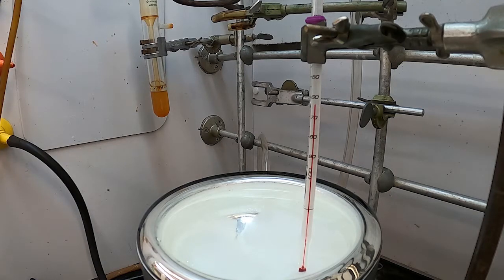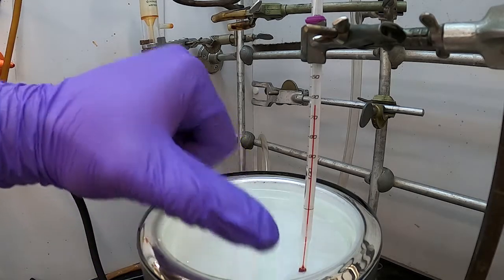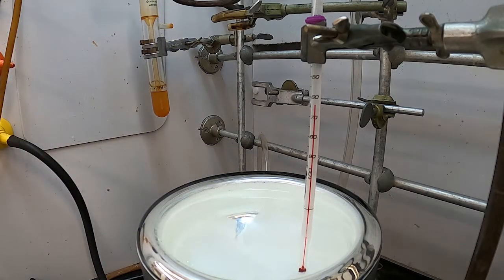So I had near 2 pounds of dry ice, and depending on how long you need it to keep it at a certain temperature, you can kind of guess it from there, but just to get your bath started, you'll probably use almost the entire 2 pounds for a bath of this size. This is probably 200 to 300 milliliters of acetone. Hard to say. This is a 6-inch dewar. It's about 3 inches deep.